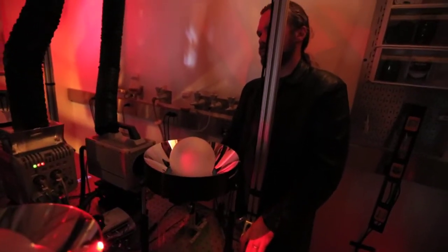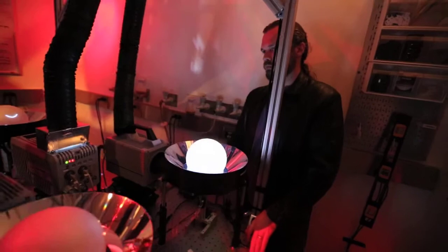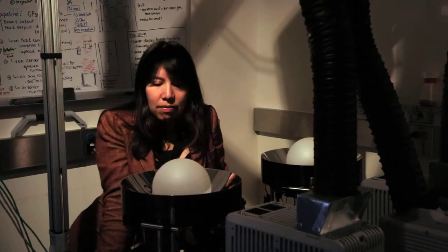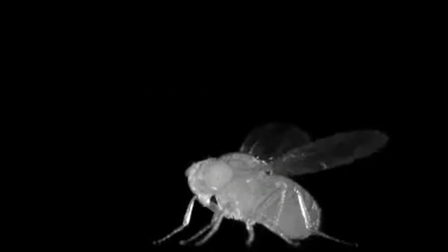Our FlyPez apparatus is designed also to work with optogenetic experiments. We genetically modify the flies, and then we can use our same apparatus, flash a red light to turn on a neuron of interest, and then capture with our high-speed video what the fly's response is to having that particular neuron activated.